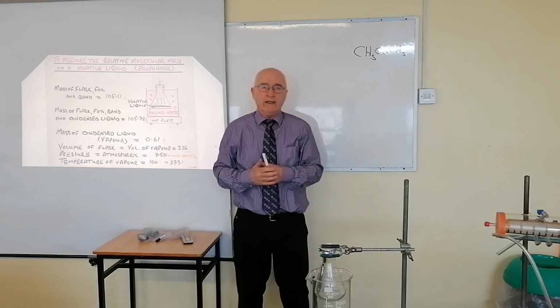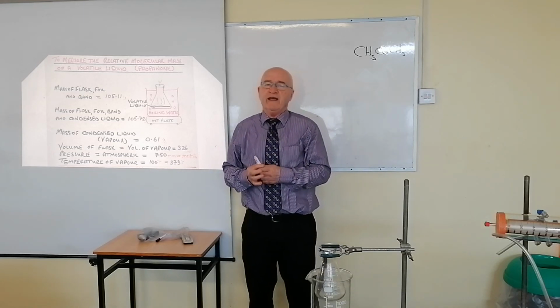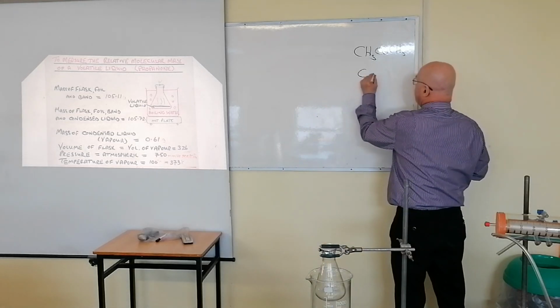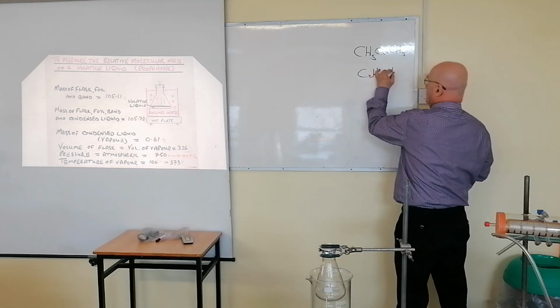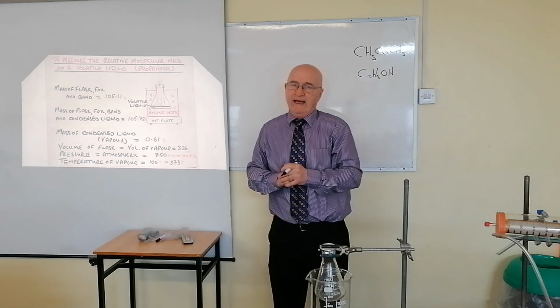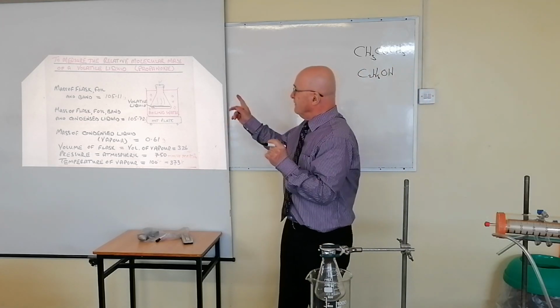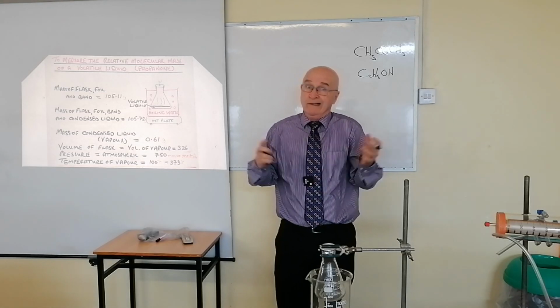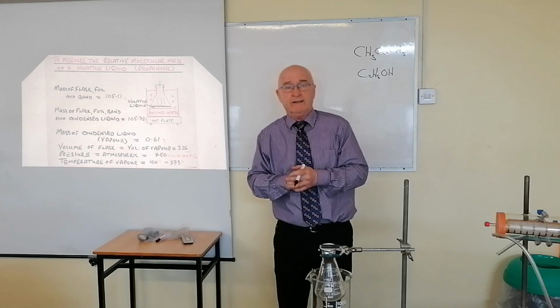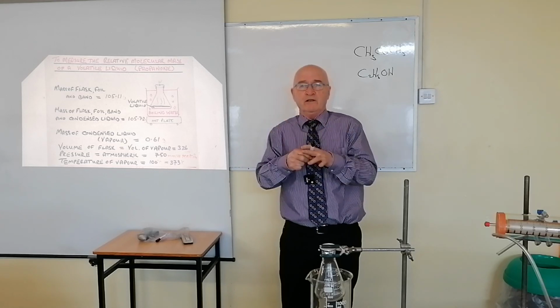That's this guy, okay? But you could use other ones. You could have used ethanol, for example. That would vaporize as well. Will you be careful, please? Ethanol. The problem is, if you take a molecule that hasn't a low boiling point, if it's not very volatile or not volatile at all, then your methods of heating it will not be practical in a school laboratory. So you're going to use something that has a fairly low boiling point.